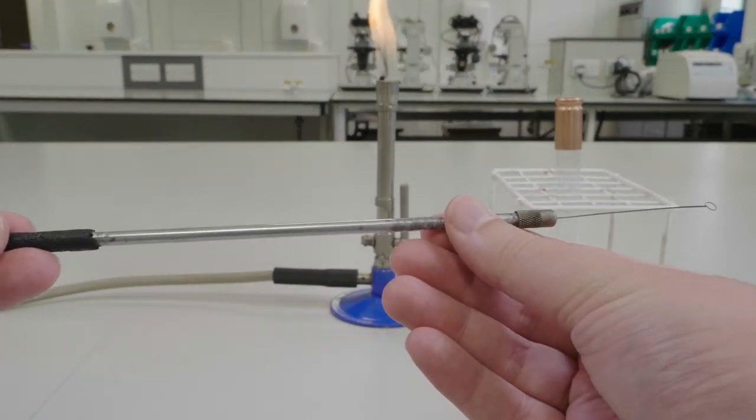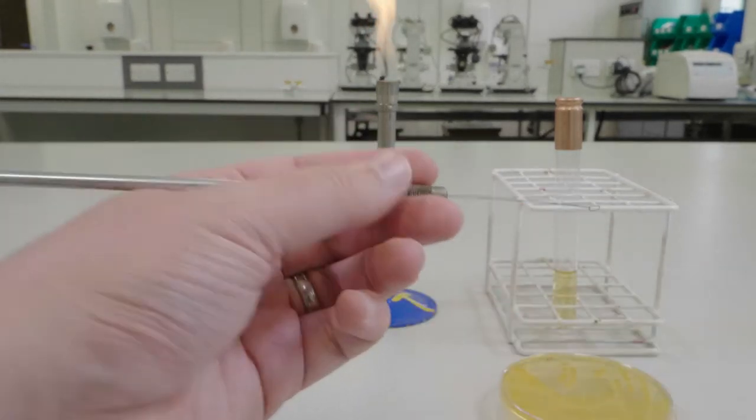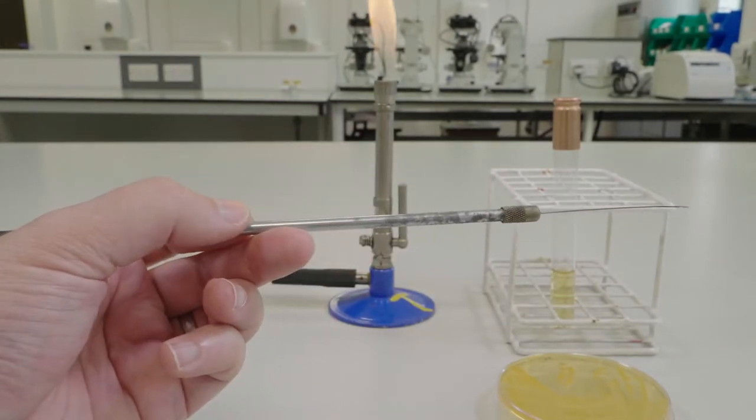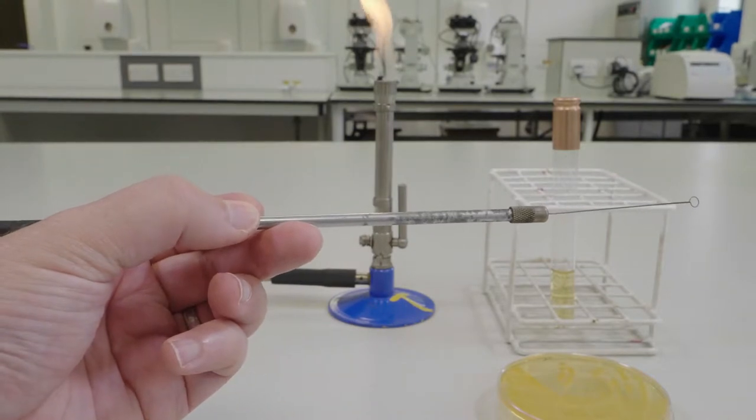There are two ways in which we hold the inoculating loop: like a pencil and like a paintbrush. I will show you which grip to use at each stage.